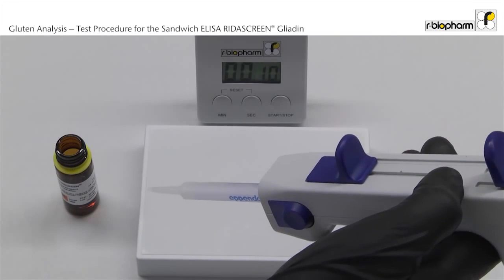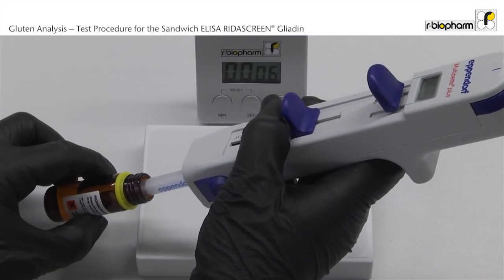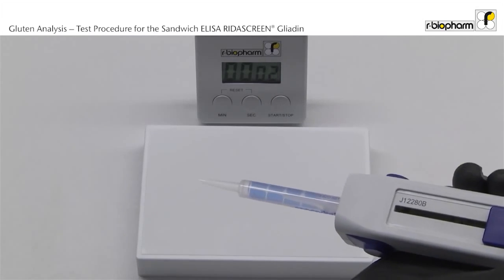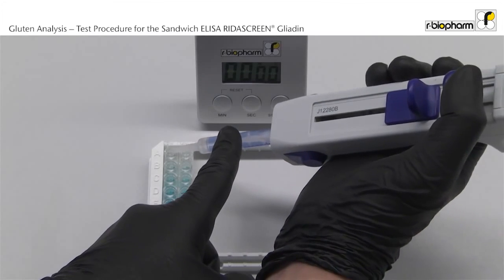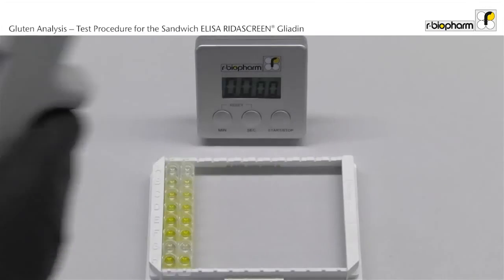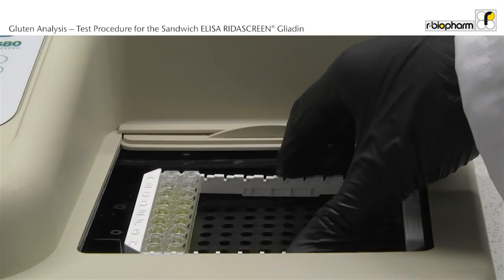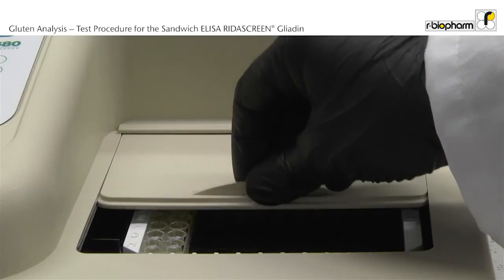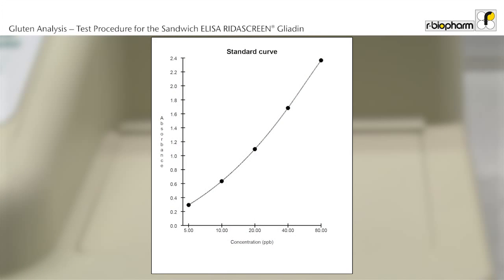After the incubation, 100 µL of stop solution is added to each well with a multi-stepper. Measure the absorbance at 450 nm within 10 minutes. Use the RIDA SoftWIN software for calculation of results.